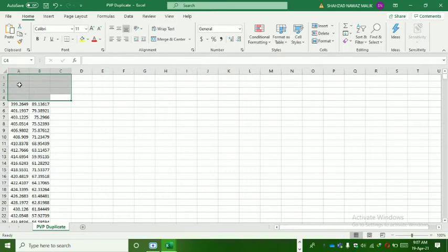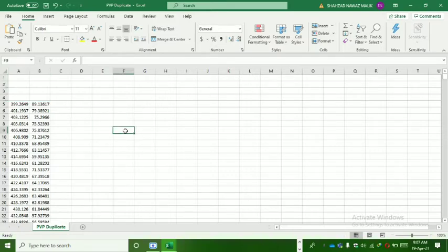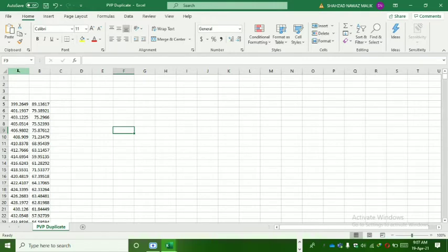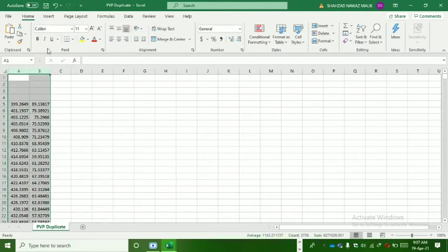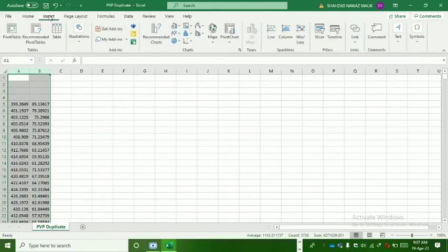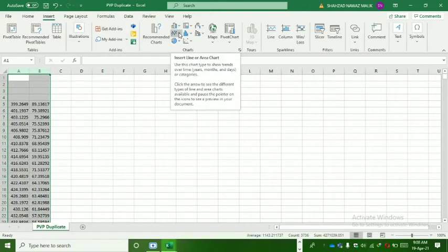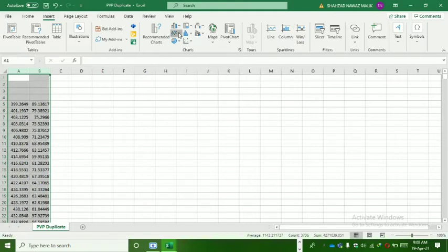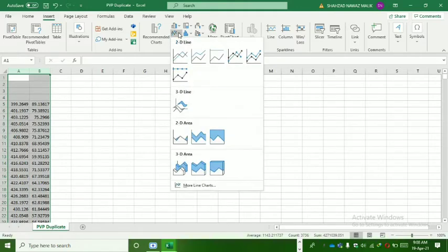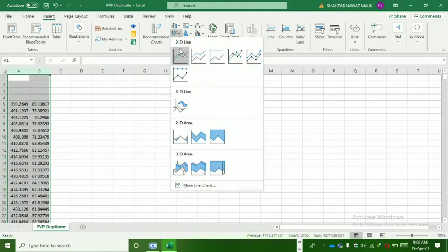For graph plotting, we select column A and B and move towards Insert. Here we see line insert and area chart options. We click on this, and for the graph line we click on the first option.